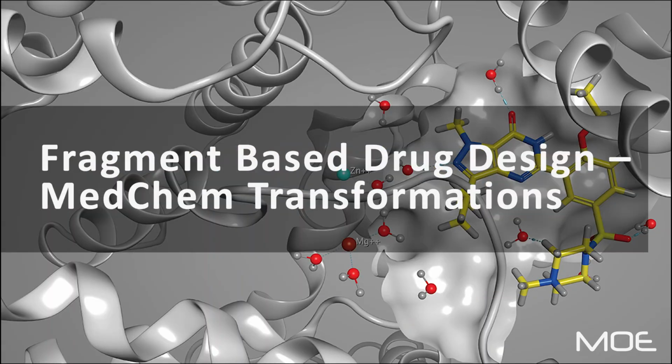Today I'd like to demonstrate the tools that we have in MOE for fragment-based drug design. In this example we'll be looking at medicinal chemistry transformations, which is a useful application when we'd like to make bioisosteric replacements directly in the binding pocket. So let's get started.